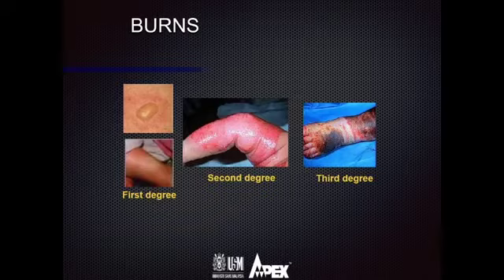And hopefully, with this lesson, you guys will have some idea of the importance of extinguishing the fire. And the best friend that we have with us in a fire incident is the fire extinguishers. And that's the reason why today we are going to talk about fire extinguisher. And if you look at the burn, I would like to just emphasize that this is a very, very painful experience. A burn victim, you don't want to be burned, that's all, okay?